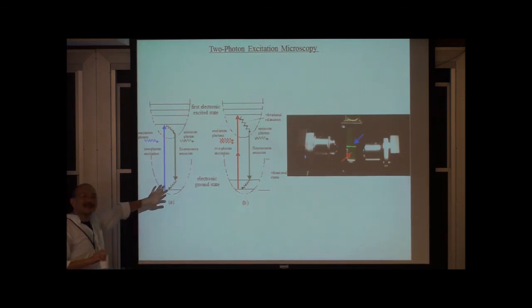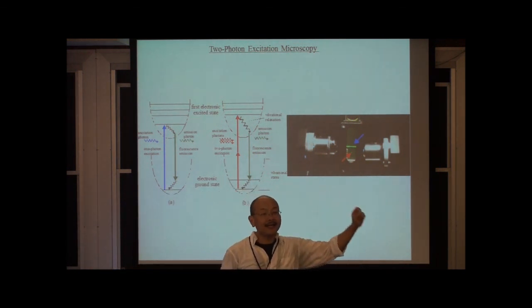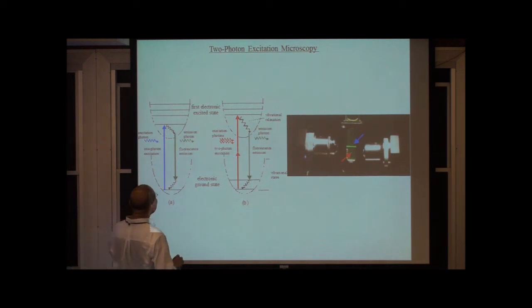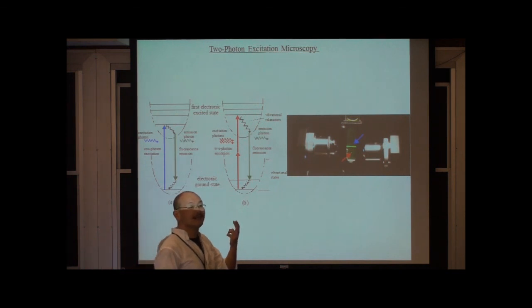The basic idea of fluorescence excitation is if you have a high energy photon, let's say a blue-green or UV photon, that might excite an electron of a molecule from the ground state to an excited electronic state, the molecule will subsequently vibrationally relax and then emit another photon to return to the ground state, which is typically at a longer wavelength, with less energy. You can actually generate the same excitation using two photons at the same time by using an intense infrared laser. So two-photon microscopy is based on an intense infrared laser.